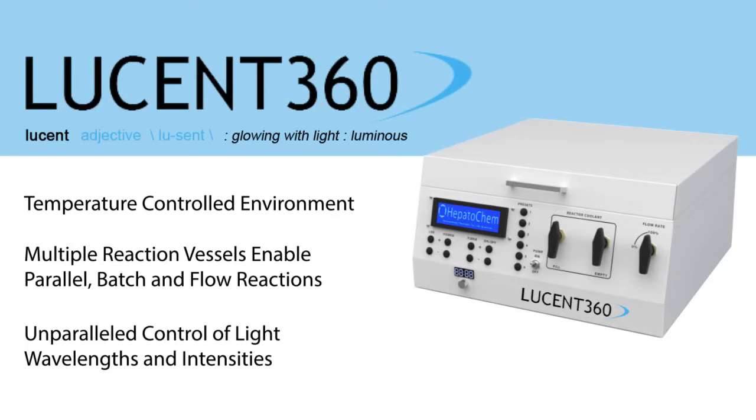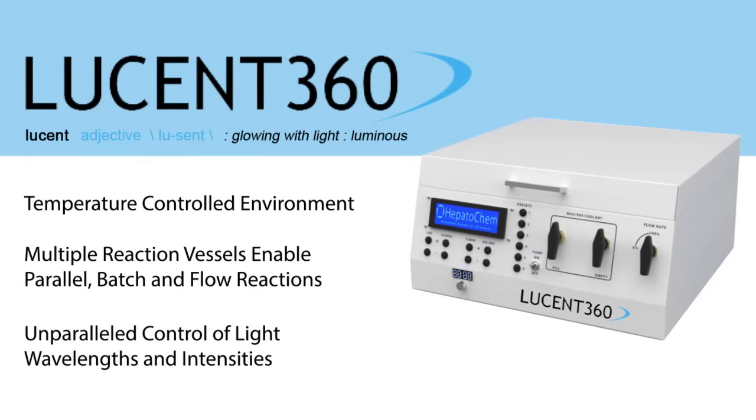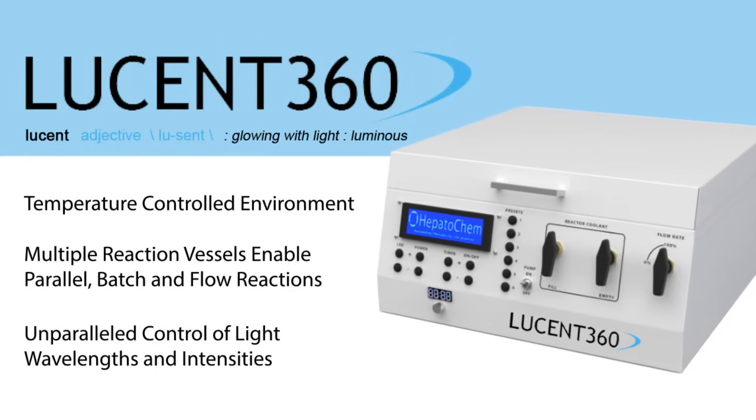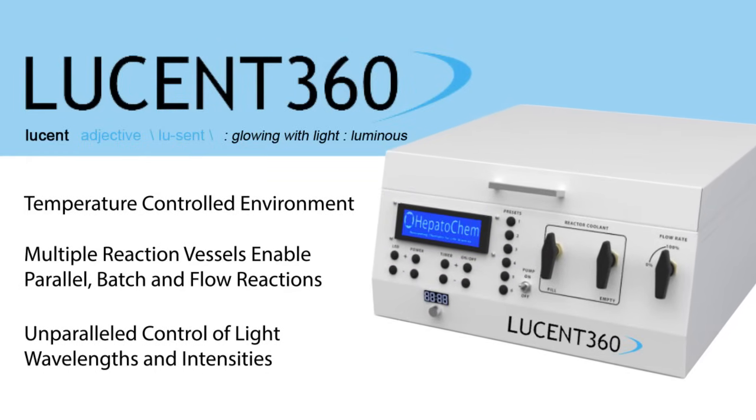Let's highlight a few of the Lucent360's key features. Its temperature control environment comes with a built-in reservoir and heat exchanger. We offer a variety of reaction vessels that enables you to easily perform parallel, batch, or flow photochemistry, and our proprietary design provides unparalleled control of both your light's intensity and wavelength.